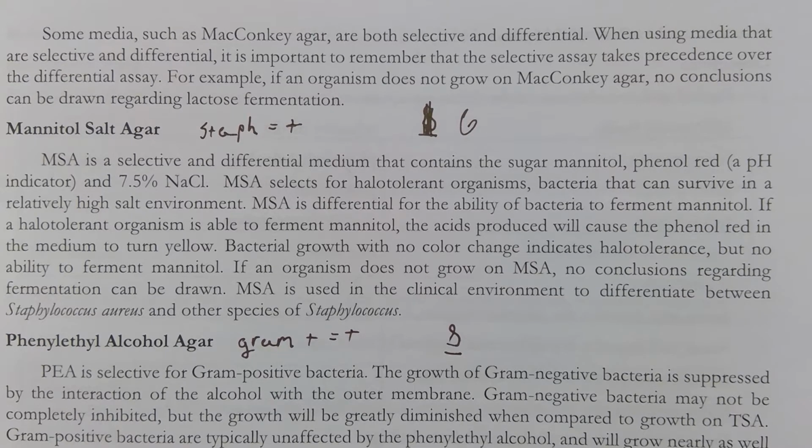When using media that are selective and differential, it's important to remember that the selective assay takes precedence over the differential assay. For example, if an organism does not grow on McConkey's agar, no conclusions can be drawn regarding lactose fermentation. So, mannitol salt agar.